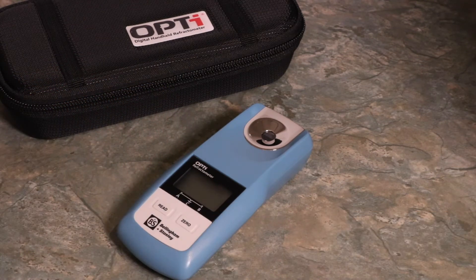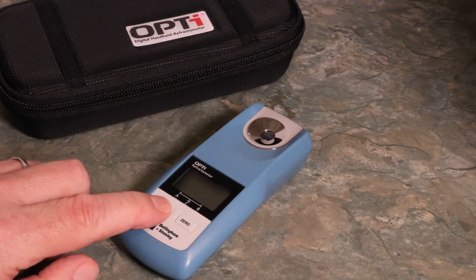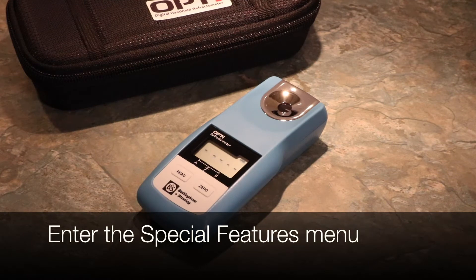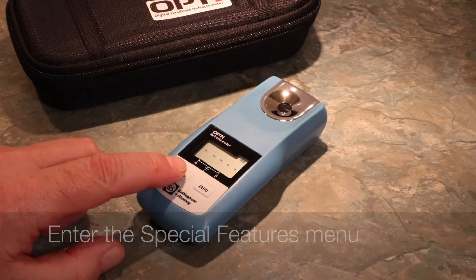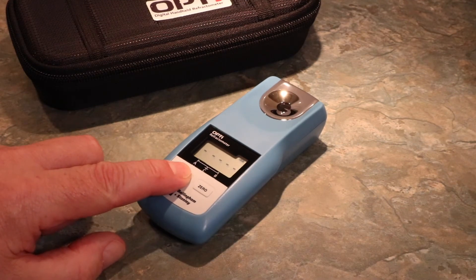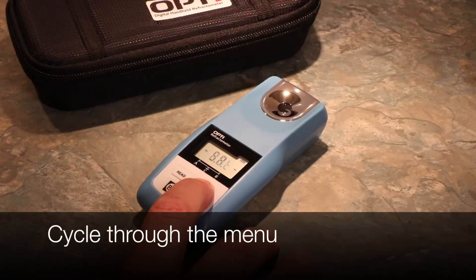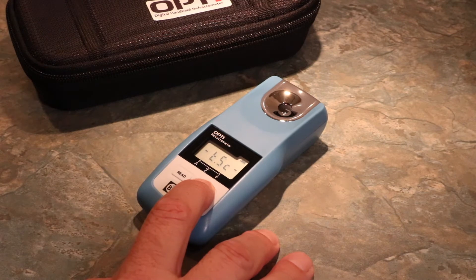Press and hold the Read button to switch on your new OptiDigital handheld refractometer. To access the Special Features menu, press and hold the Read button. As soon as Off is displayed, press the Zero button. Once in the menu, you can easily browse by pressing the Zero button to cycle through the options. Press the Read button to enter or confirm a selection.